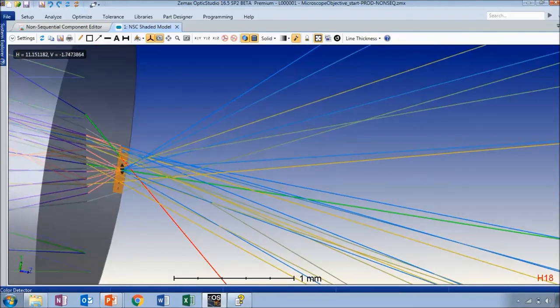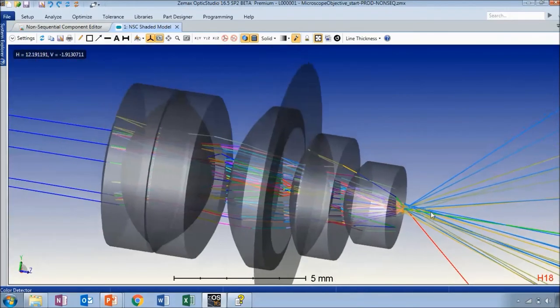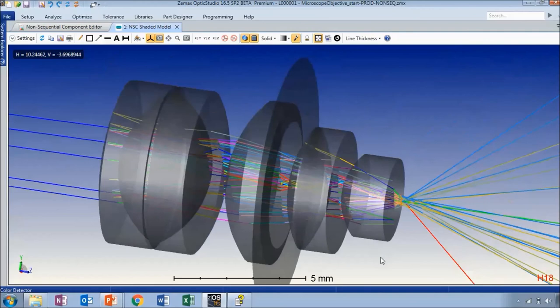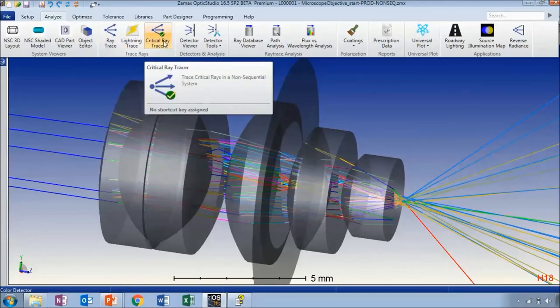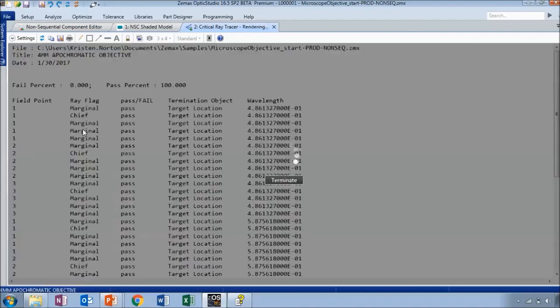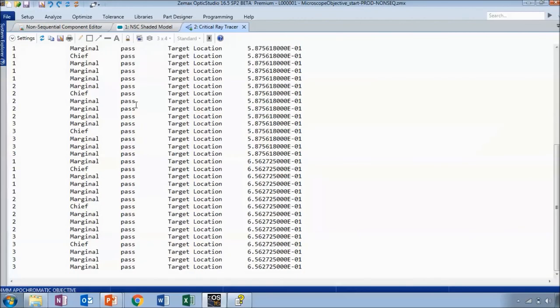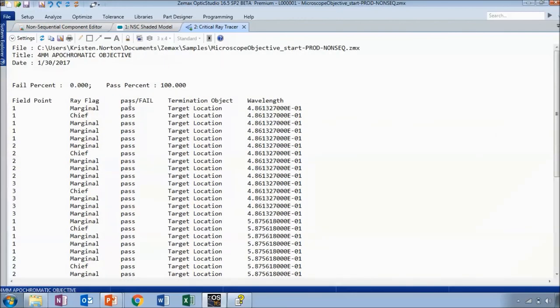There are quite a few rays and many that miss the detector altogether. We can use a filter string to show only rays which hit the large area detector — which is object 18 — using the filter string 'H18.' Now all of the rays traced pass through the detector. There's one other tool to show: in the analyze tab, the critical ray tracer. Using the input file created just before converting to non-sequential, you can see a pass/fail marking for all of the rays traced in that reference file. All rays for which the target location was determined in sequential mode have the same target landing point in non-sequential mode, confirming the file was converted successfully.